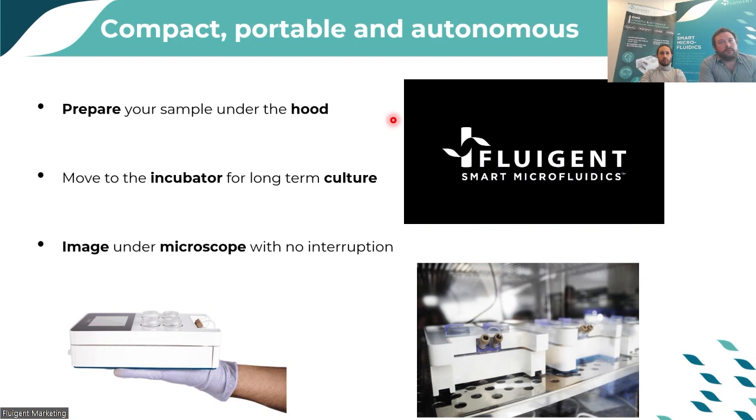So as OMI is totally autonomous, you can unplug it and transport it from one element to another freely. There is a battery inside, so it will still keep working while you're moving the device from the hood to the incubator or the microscope.